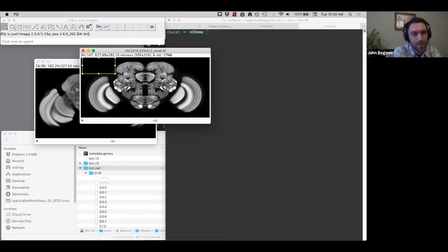It has to be careful. You're right. Sometimes, for example, there's probably a chunk here that is entirely contained. Given that I said write this image into this area, this top left chunk, for example, I could just completely overwrite with the data here. But somewhere here, there's going to be a chunk that is partly overwritten by the subset that I was trying to write into. And I think this is what you were getting at.